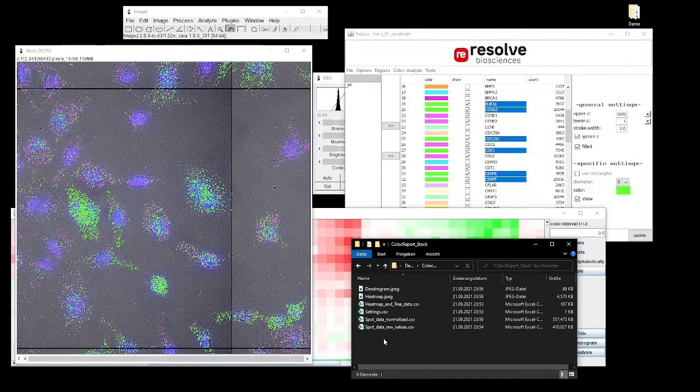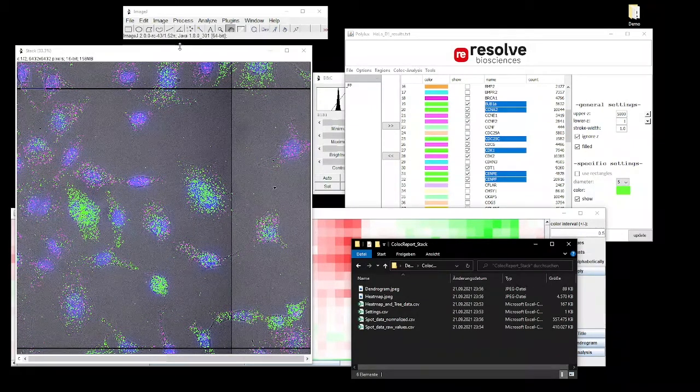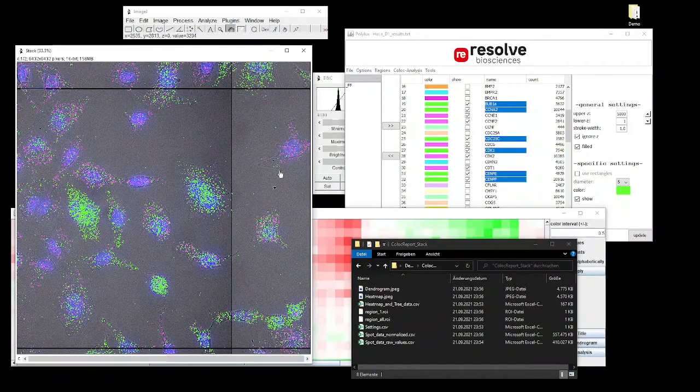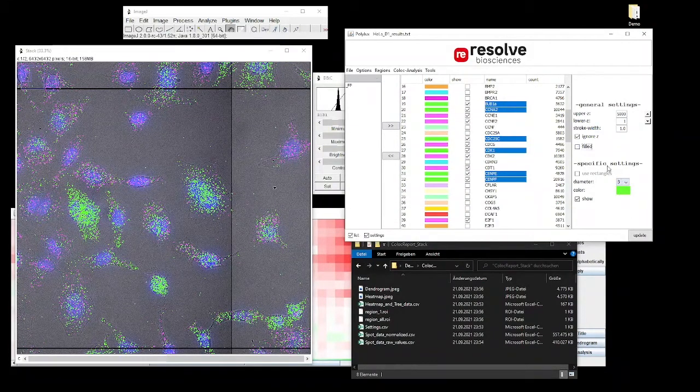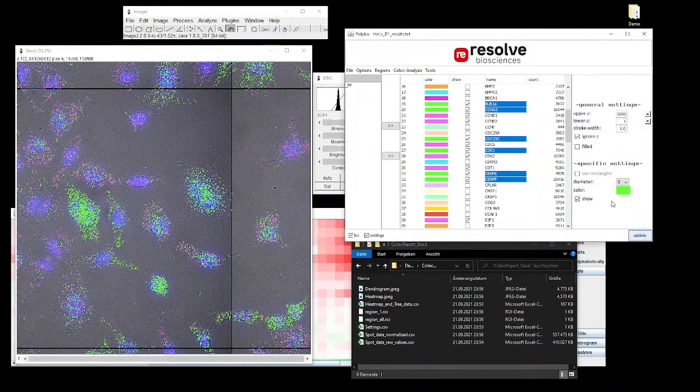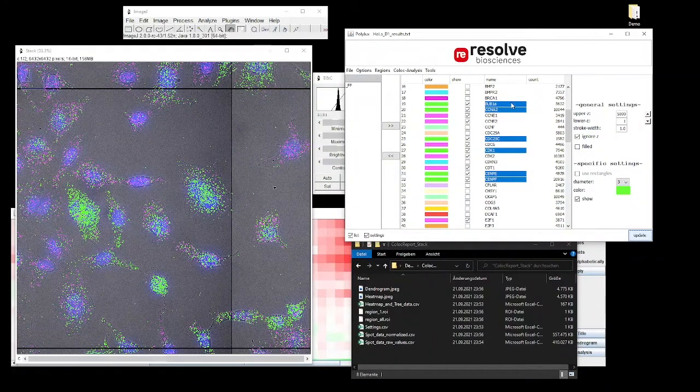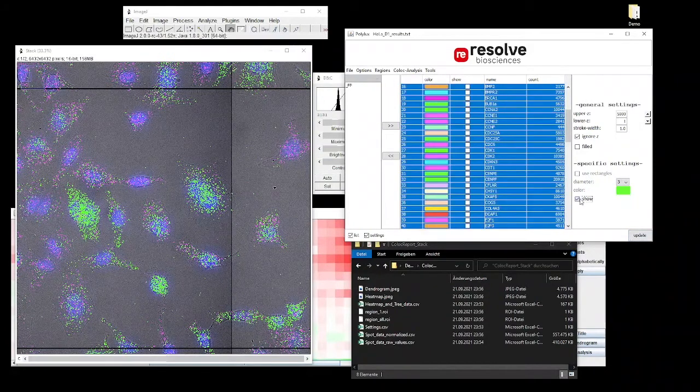Now we have saved the results and we have a dendrogram and a heatmap image file, and also the transcript locations as comma separated text values to explore the data we have generated further.